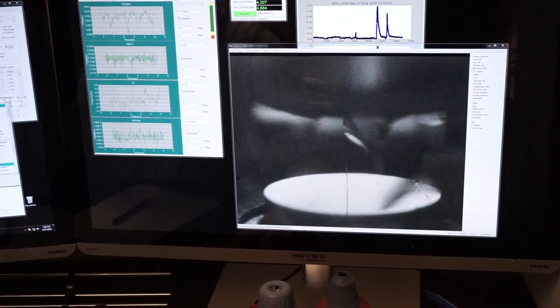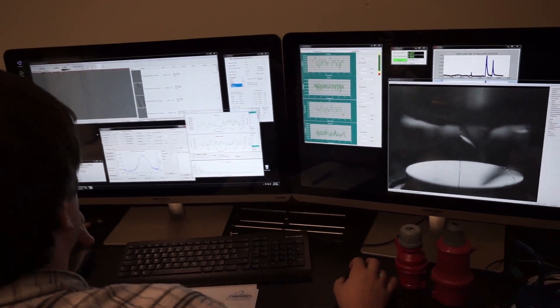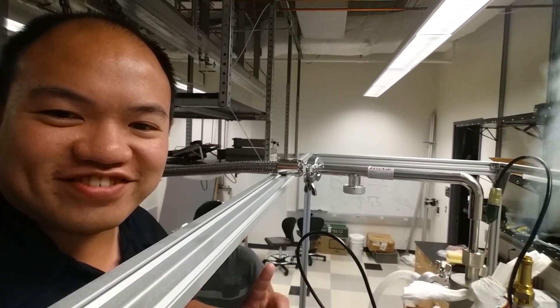Doing AFM-STM imaging with the Q-Plus sensor. First helium fill in the system. Look at DC. DC is really excited.